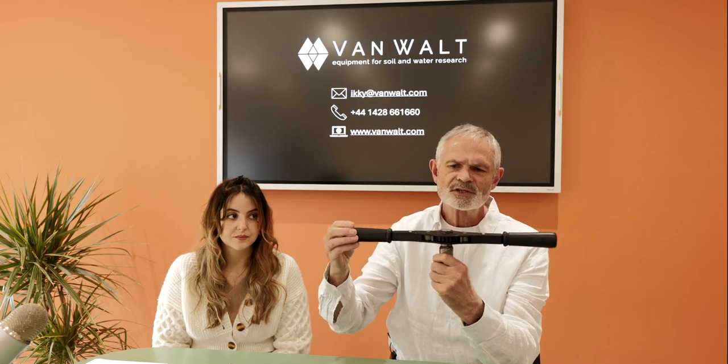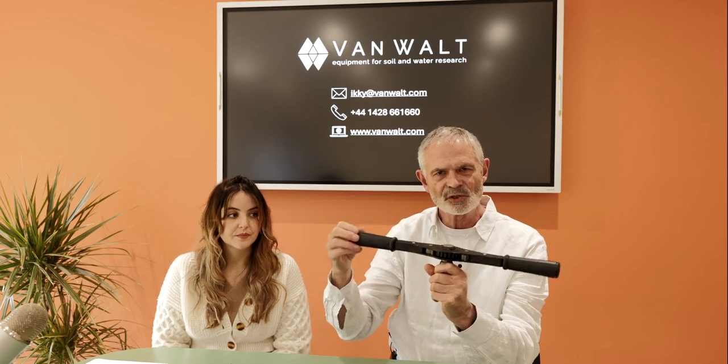If you're taking many samples, so repetitive samples, it is better to use a handle which is on a ratchet. So this is a ratchet handle. You can twist without actually damaging your body. So if you're taking a lot of samples, we would strongly recommend that you take a handle which makes your life a little bit easier.